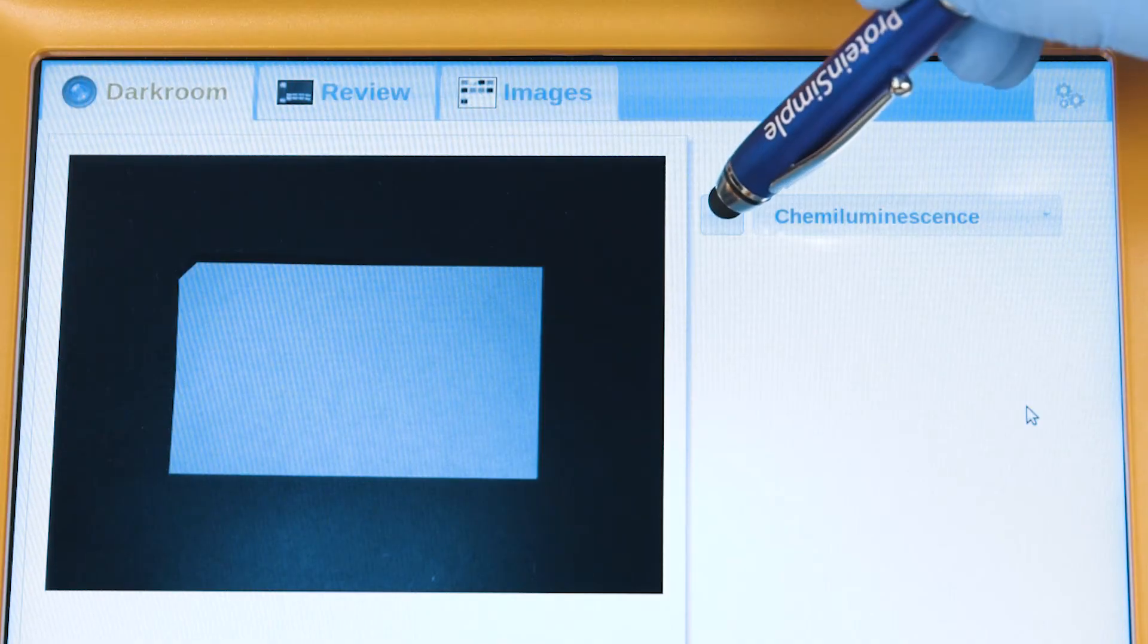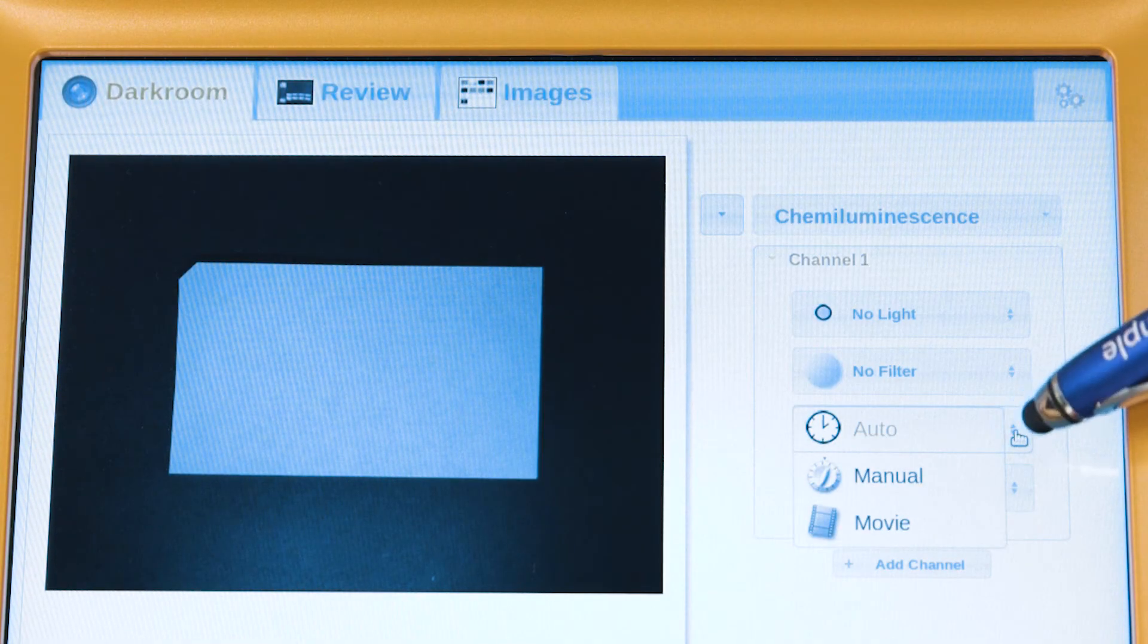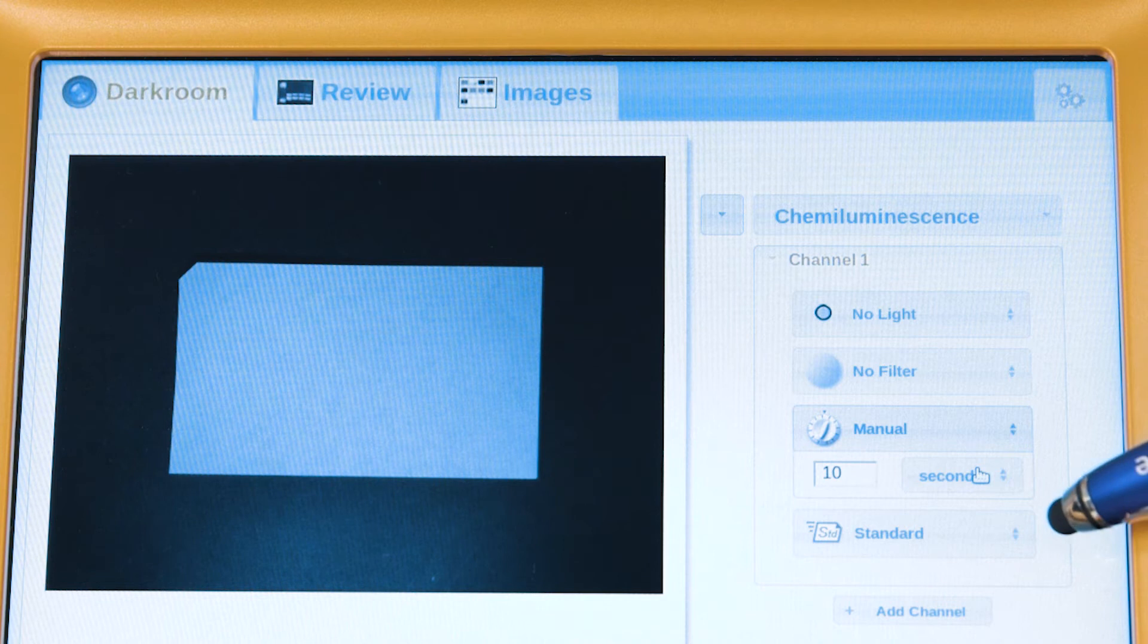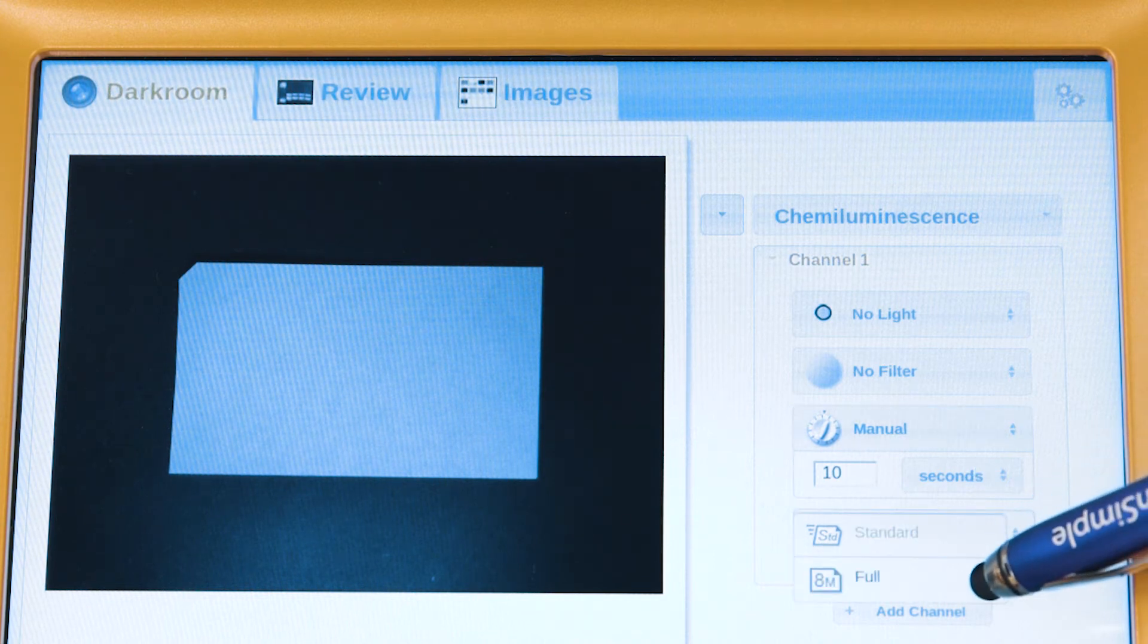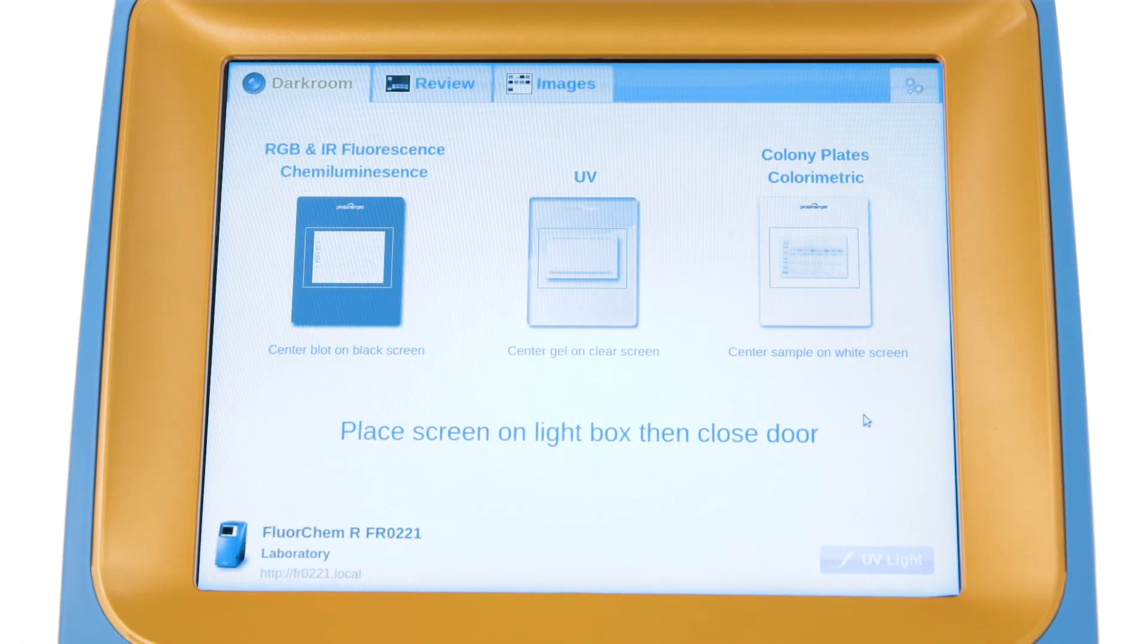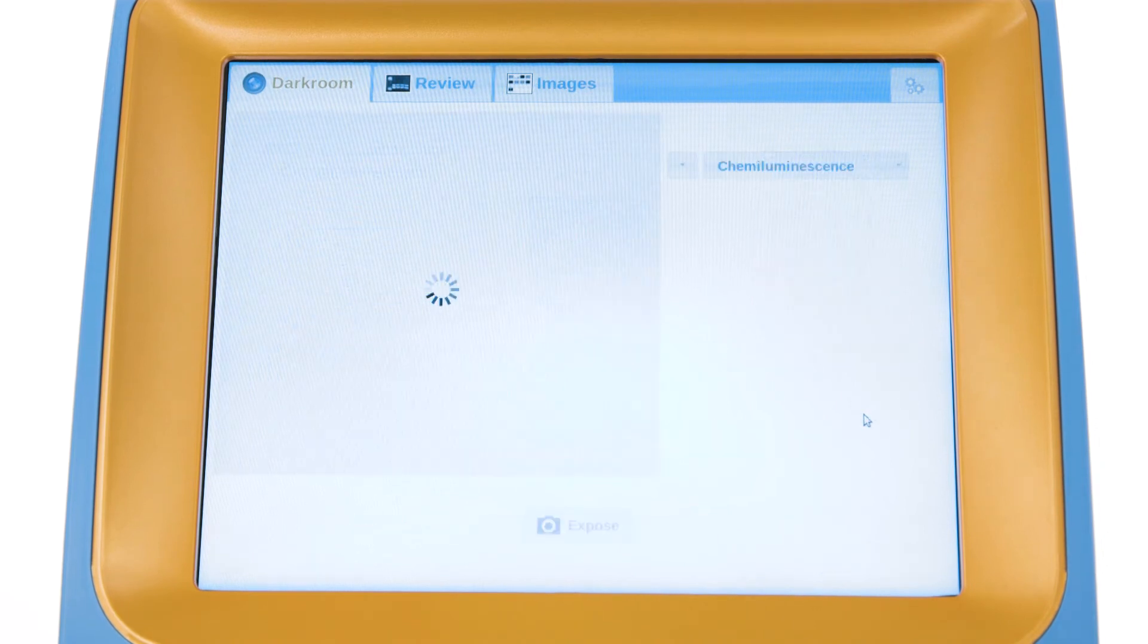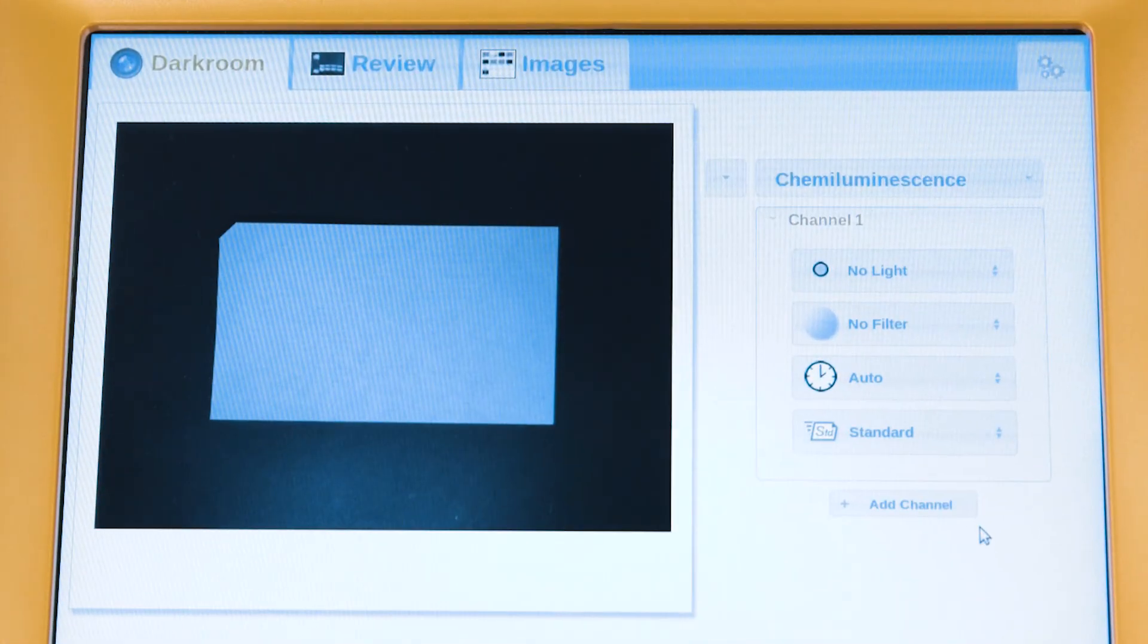Each protocol has settings that can be modified, such as exposure times, movie mode, and binning levels. Once the door is opened to unload the sample, any changes made to the protocol are reset, so that the next user doesn't have to worry about unexpected changes.